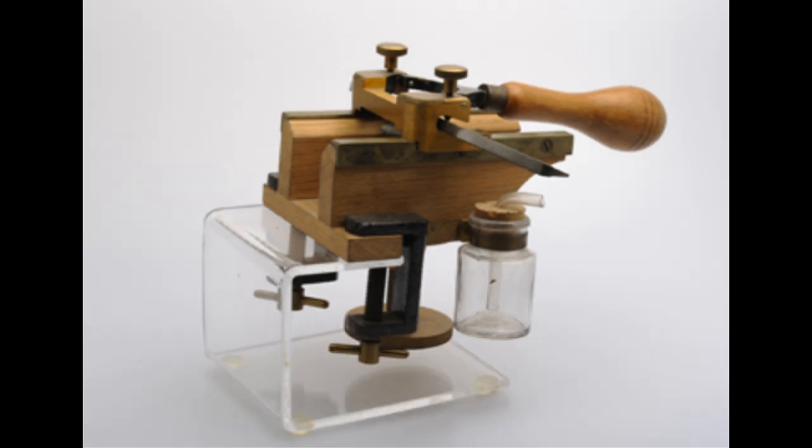This is the Cathcart Freezing Microtome, which is dated 1906, named after Charles Walker Cathcart, conservator and curator of the museum.